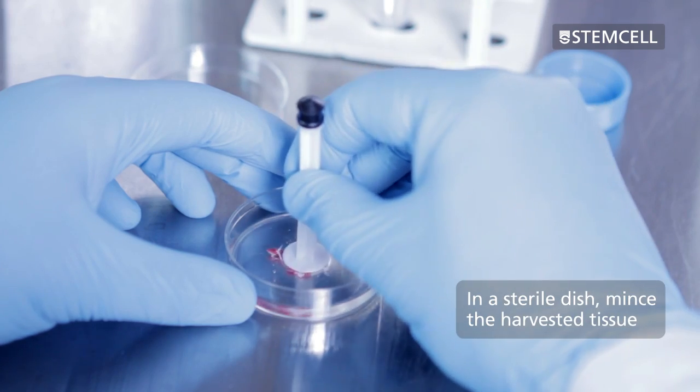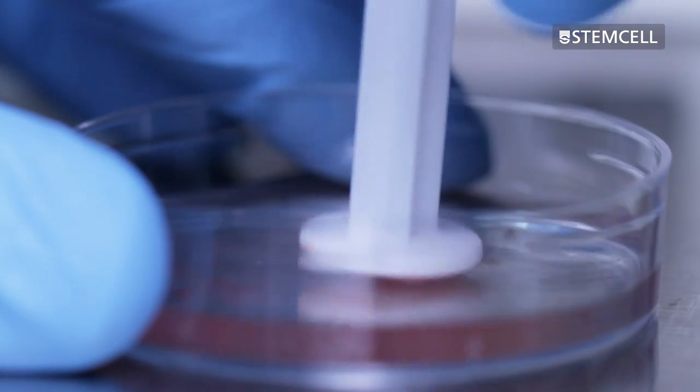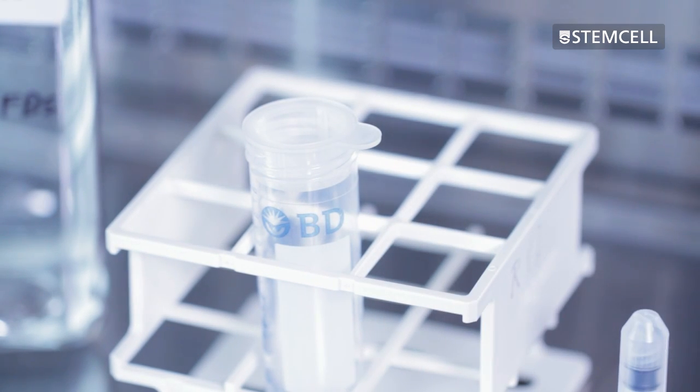In a sterile dish containing dissociation medium, mince the harvested tissue. Place a mesh strainer on a sterile 50 mL conical tube. A 70 or 100 micron cell strainer works well.